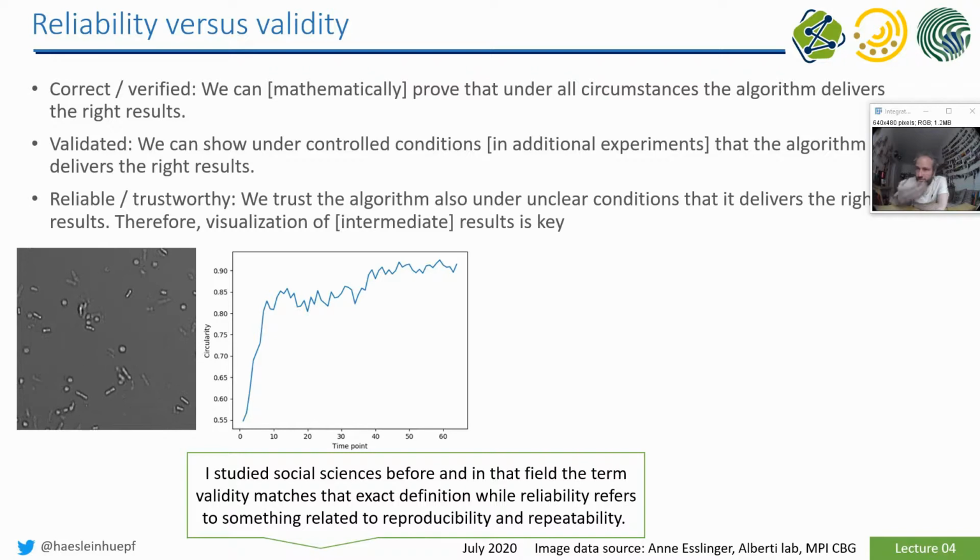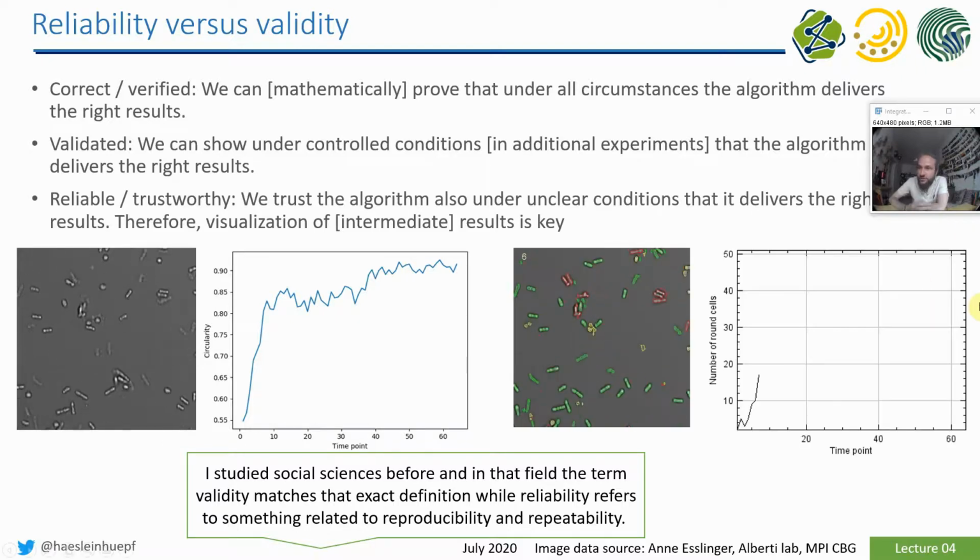So I'm sitting in front of my computer and I develop workflows all day. And when I develop a workflow like that, I'm not happy because I don't trust it. I don't think that this is reliable yet. And there visualization of the results plays a big role, and this may also lead you to do different measurements.